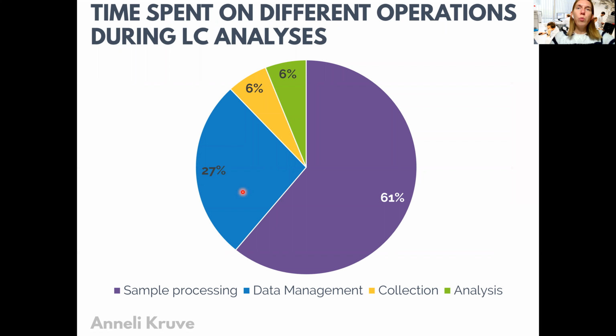And a slightly later question here also asked about the time that the labs are consuming on different steps in the liquid chromatography analysis, because this was still conducted by LCGC's journal. Interestingly, it turned out that among sample preparation, data analysis, collection of the samples and analysis time, the sample preparation by far consumed most time.